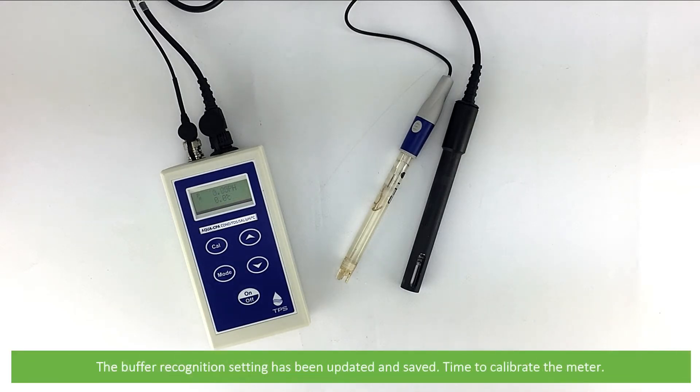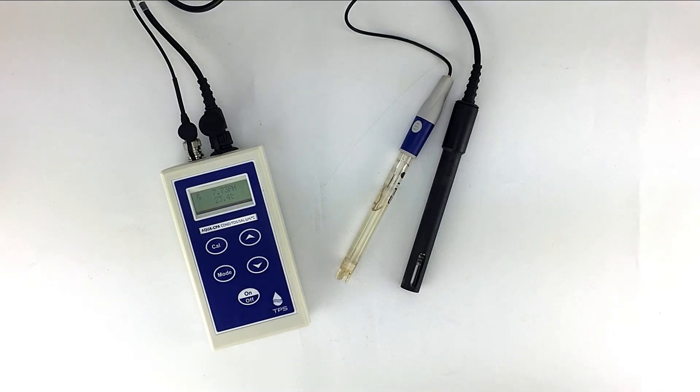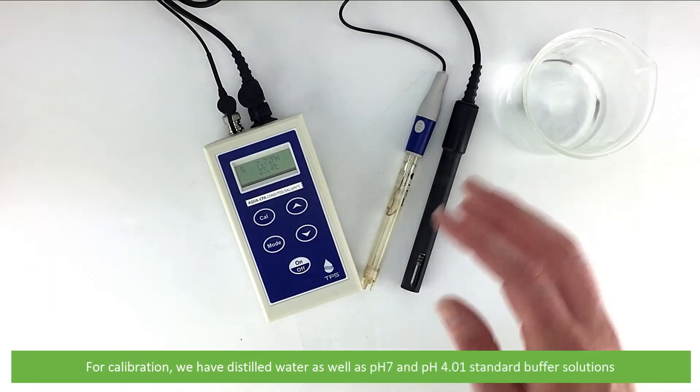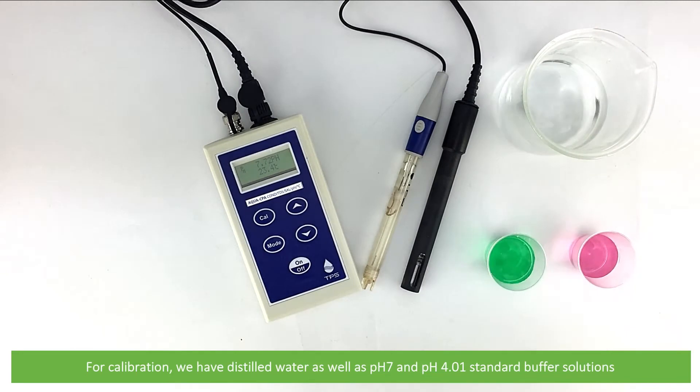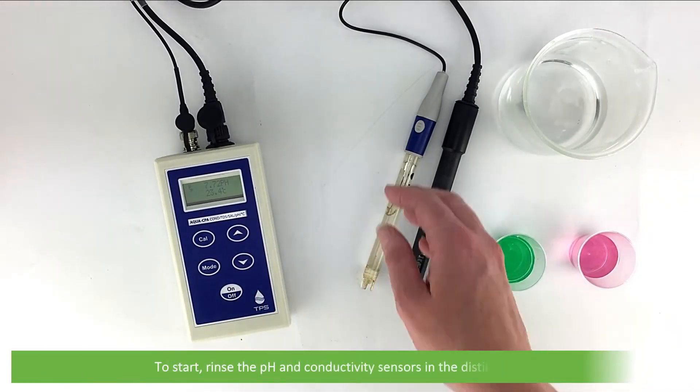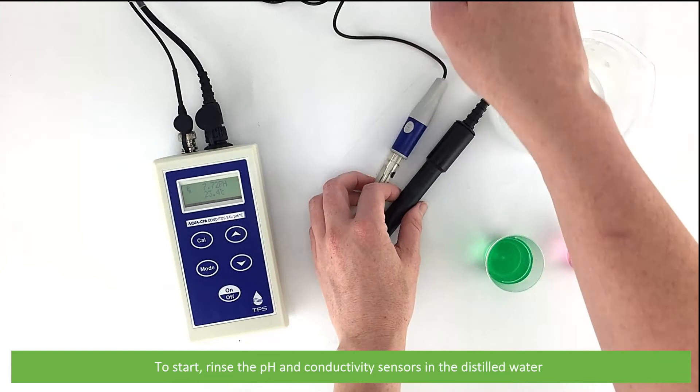The buffer recognition setting has been updated and saved. Time to calibrate the meter. For calibration, we have distilled water as well as pH 7 and pH 4.01 standard buffer solutions. To start, rinse the pH and conductivity sensors in distilled water.